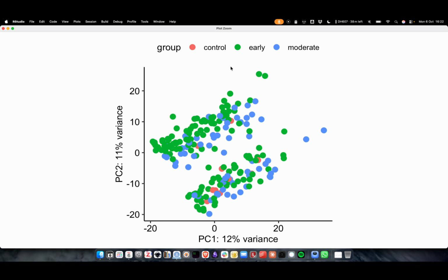So PCA is a fantastic technique. In fact, one of the questions I usually ask people in different settings is: what would be the input source so that you will get this kind of data distribution? What do you think is happening in the input data source structure that you get a pattern like this?